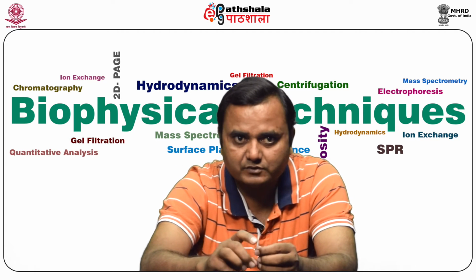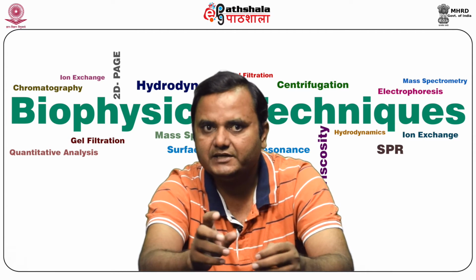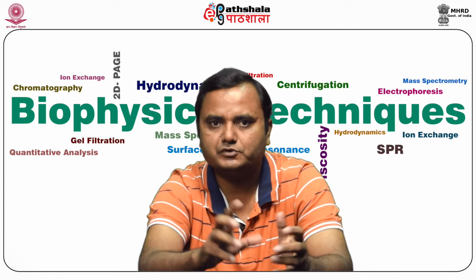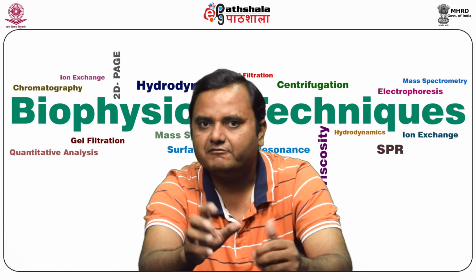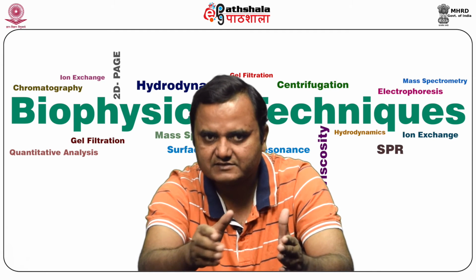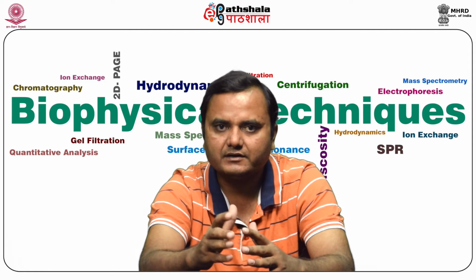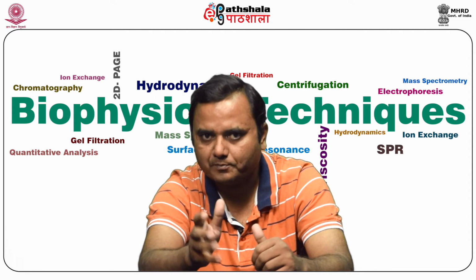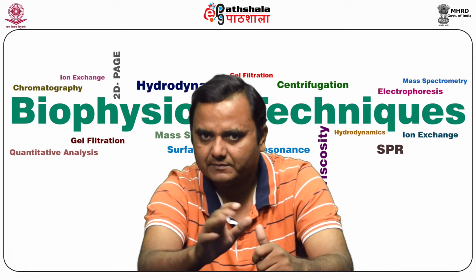So when a suspension of particles is centrifuged, the sedimentation rate of the particle is proportional to the force applied, and this is given by a well-known equation known as the Stokes equation, which states that the centrifugal velocity V equals d squared into (rho p minus rho l) divided by 18 mu, multiplied by g.